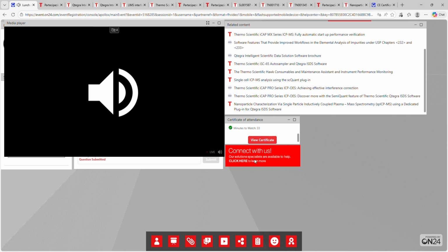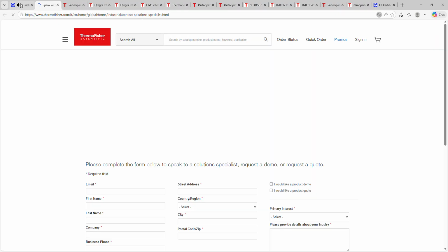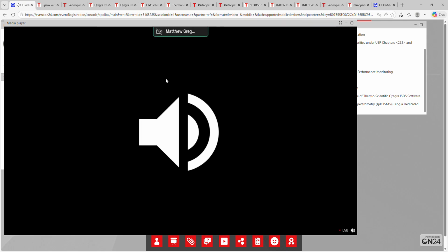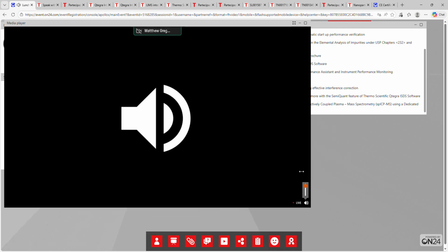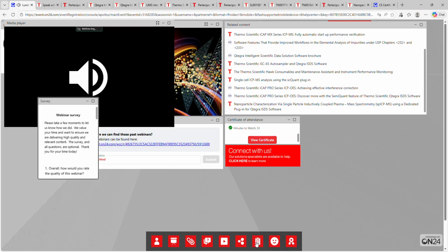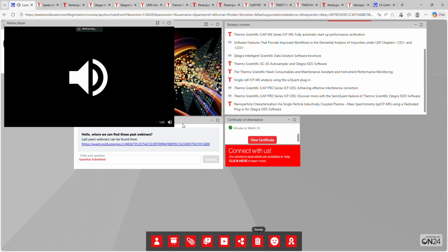And there's no reason why, if we're using maybe one mode, we couldn't get to less than 1 minute a sample. If we're then using multiple modes, if we're using axial and radial, then it may go up a little bit. Again, if we're using longer exposure times, it may go up even more. But really, we should be able to get less than 3 minutes a sample, definitely.